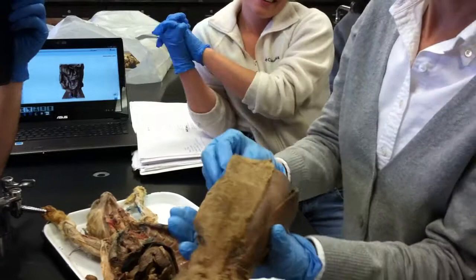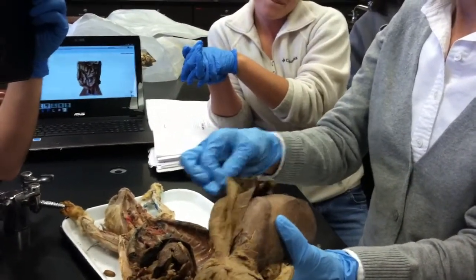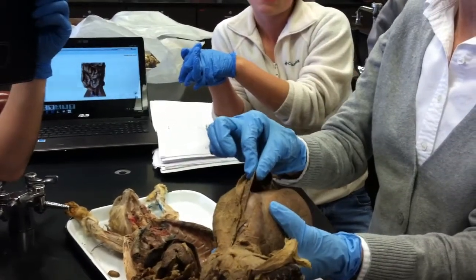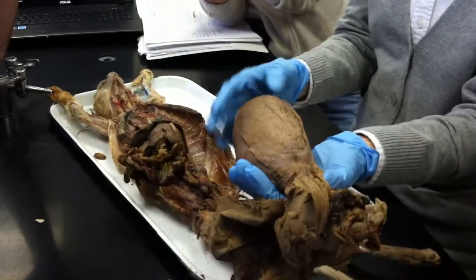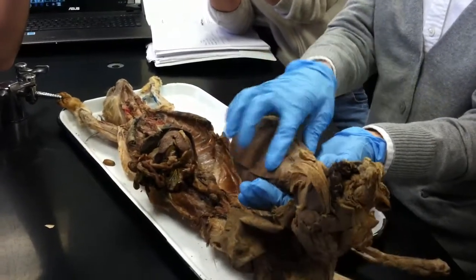If we look at the testicle itself, there are two membranes that surround it. The tunica vaginalis is the outer one. The albuginea is the inner one. Get those out of the way. There it is. Okay. This is the testes. This right here, this kind of C-shaped piece, is the epididymis.